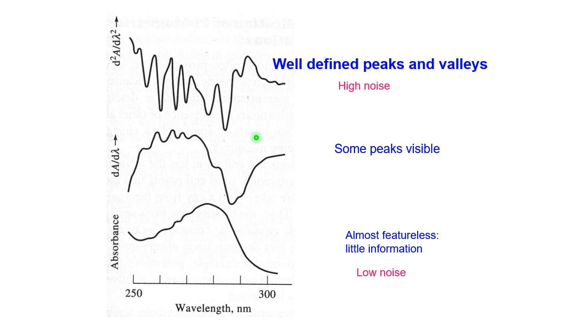The problem is that the resulting spectrum has high noise coming from the experiment, because you are taking a difference. Any experimental problems will cause distortion of your spectrum. It's not easy to measure. Nevertheless, in this case, you literally have a fingerprint of your compound.